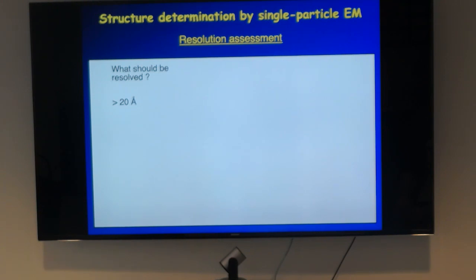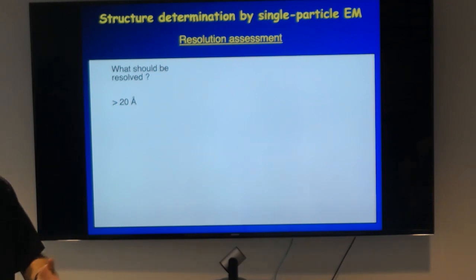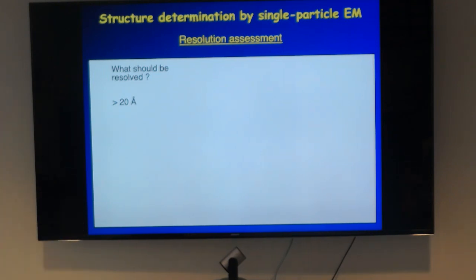Smooth. What is the technical term of a blob? Surface. Domain is good. Surface. Let's call it a molecular envelope, or a blob. Anyway, at 20 angstrom you get a protein envelope, and you can resolve domains and things like that. At 9 to 10 angstrom, what do you expect to see?